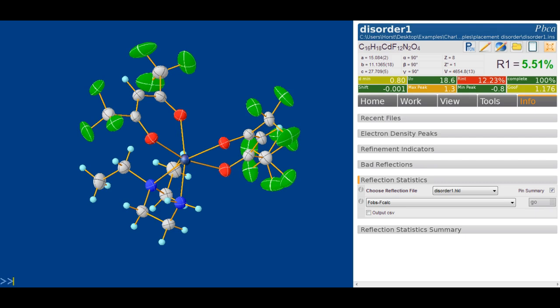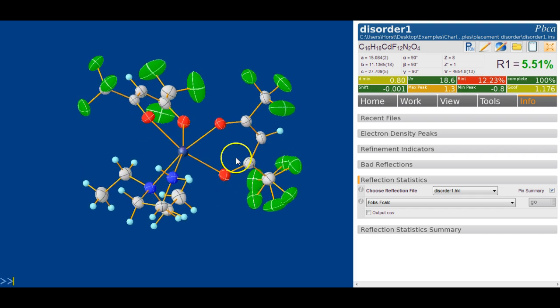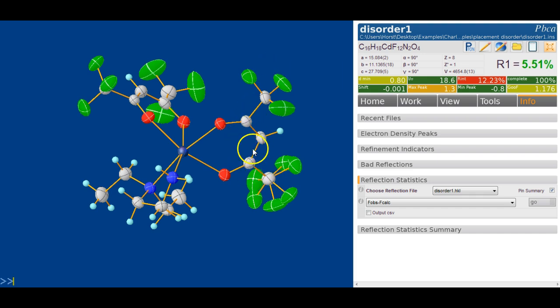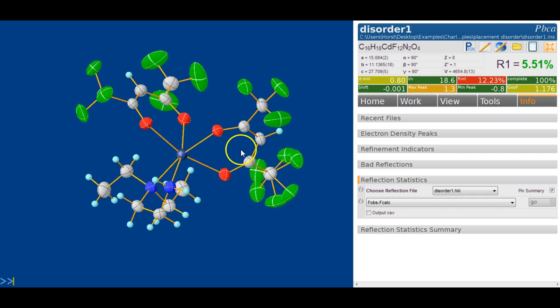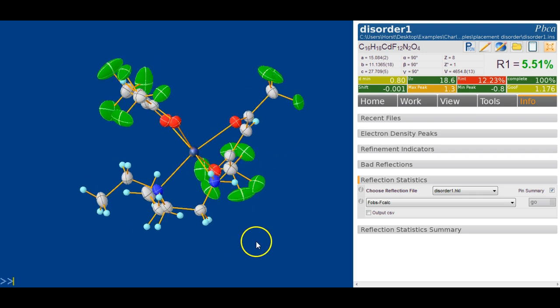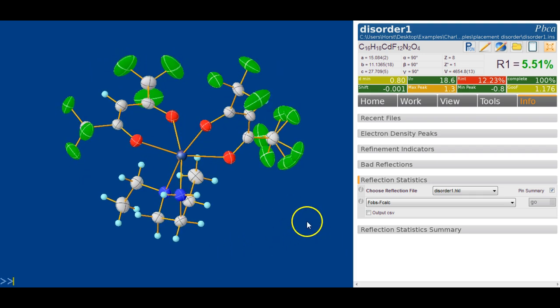Let's look at a disorder example in OLEX2 today. The disorder we want to look at is the quite frequent, quite common CF3 rotational disorder. So here's what we're looking for - it's been modeled in this example here. This is one of Charlotte Stern's examples.